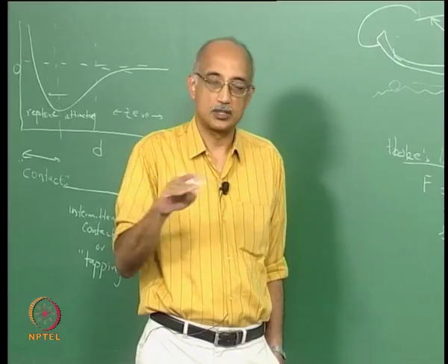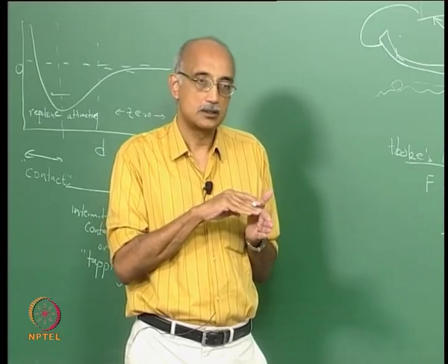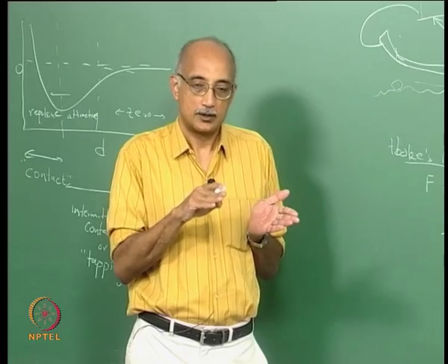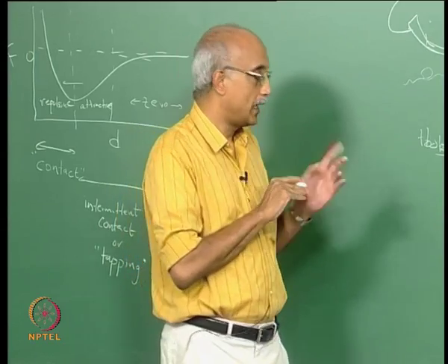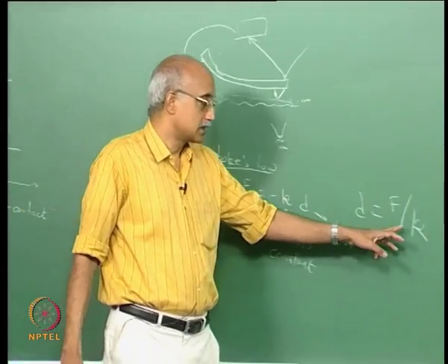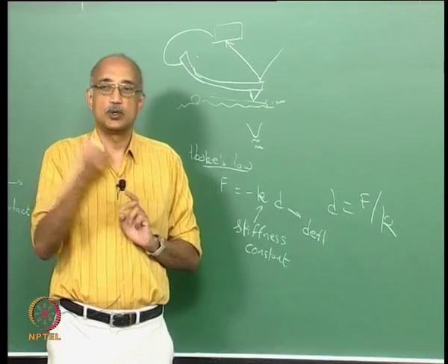Depending on the position of the probe, the oscillation will periodically put it in direct contact with the surface. So once in a while, the probe will make contact with the particle surface. But the key difference is, in this case, you can set the stiffness high enough that it does not lock in. You can pull the probe back.